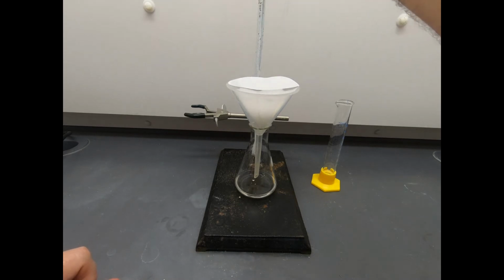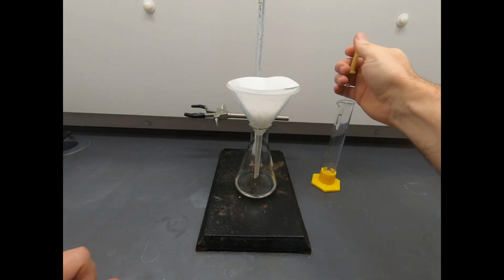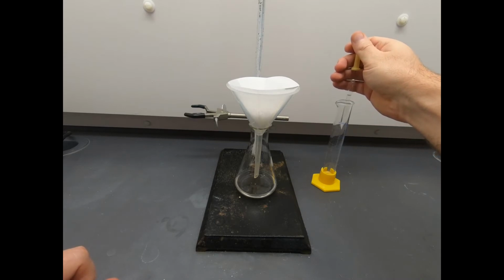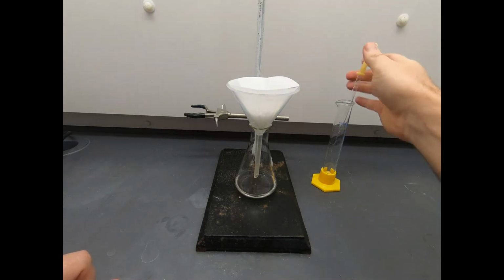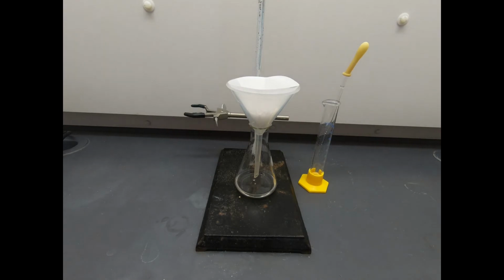And I'm just dripping isopropanol down this funnel so that it flows through the paper and hopefully rinses off any aspirin that is trapped in that filter paper. And I think I'm going to stop there. Am I stopping because I know that the rinse is complete? No, I'm not.